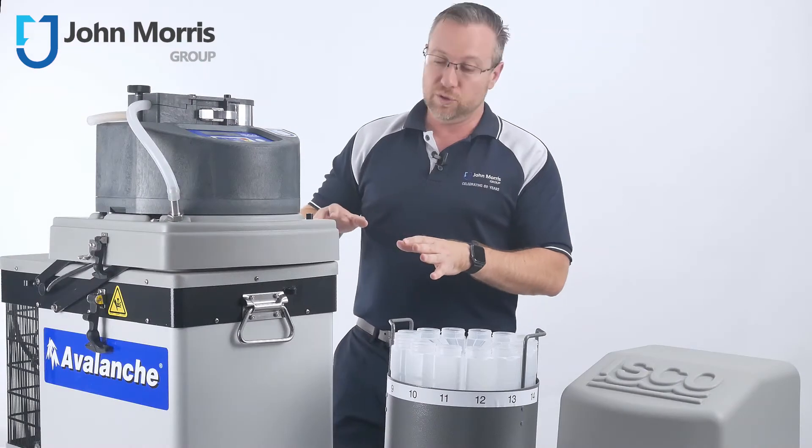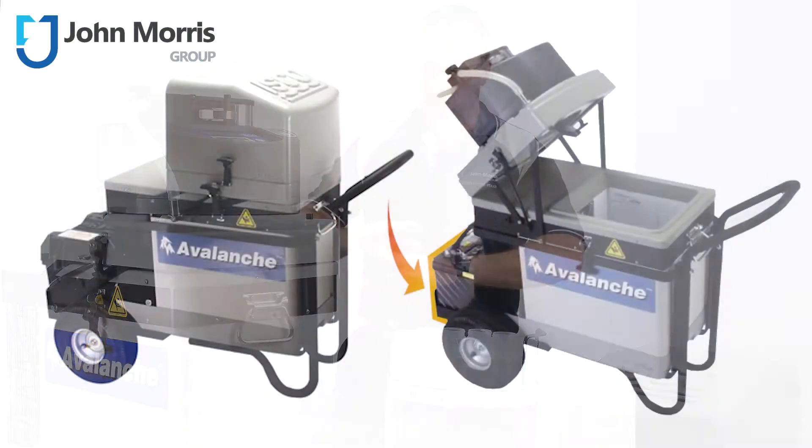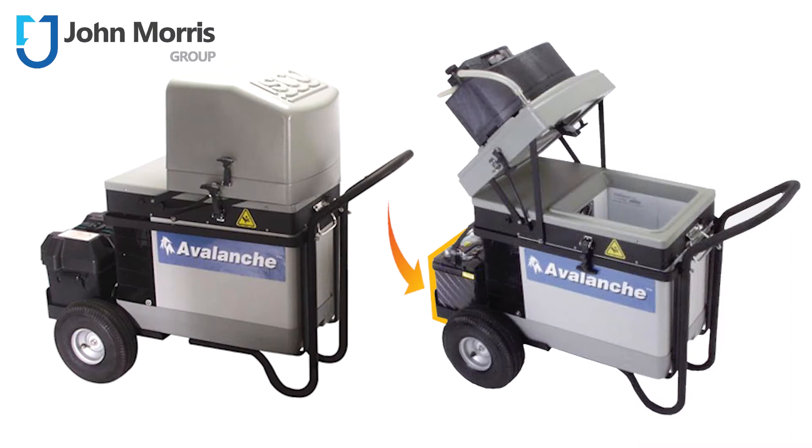We regularly sell these units with a cart, which makes them very portable and easy to wheel around and transport. On the front of the cart is a space for you to put your 12 volt deep cycle battery.